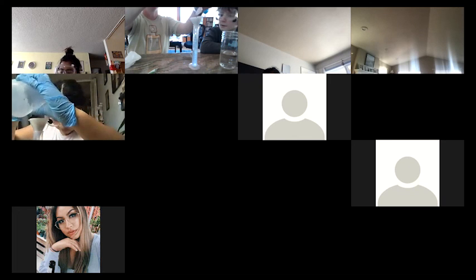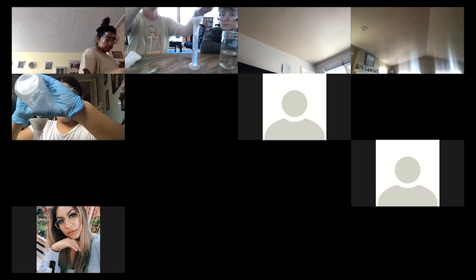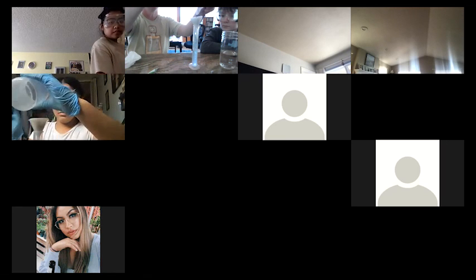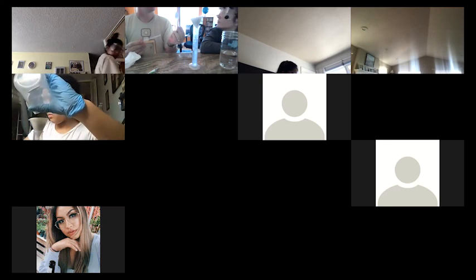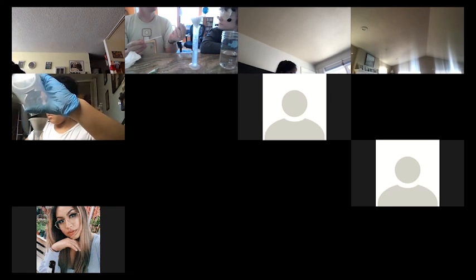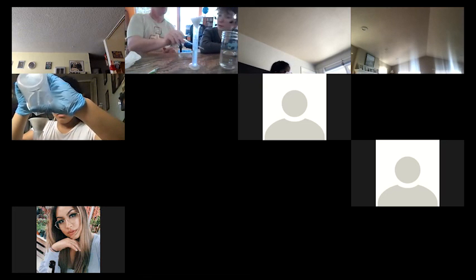I don't think some of this is coming off. So you're just going to have to. So this is one of the things, whenever you do an experiment, you put down potential sources of error, because there's always going to be error. So this would be a potential source of error: the fact that we've got copper stuck to the spoon and we can't get it off. Yeah, but I think we did pretty good.